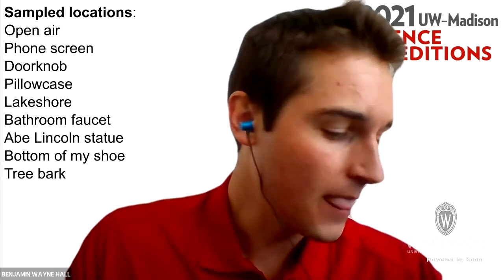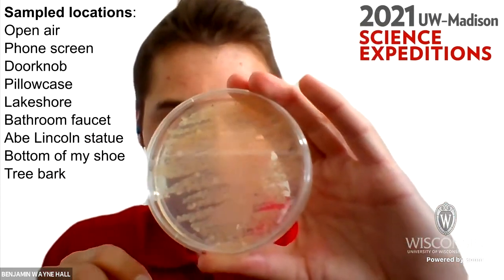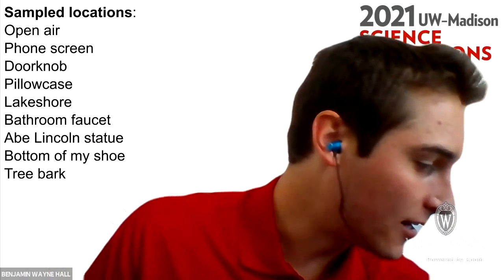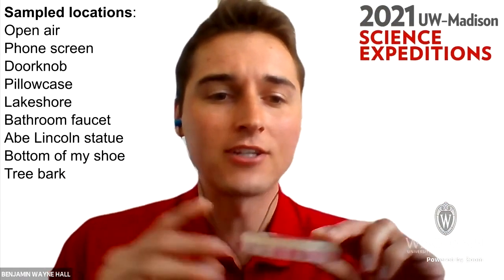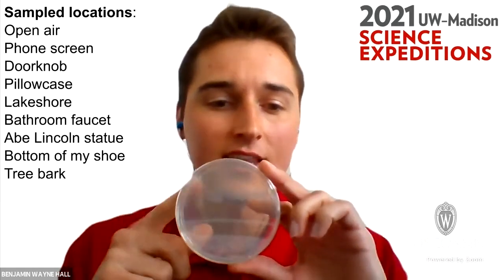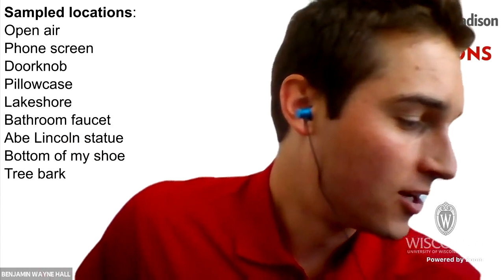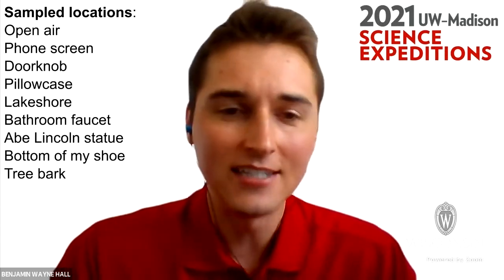So maybe lots of these bacteria from the lake just really like the food that I gave them. And the phone screen, maybe this just wasn't the right food. So if I went and repeated this experiment and tried with a different kind of food, we might actually see that this plate from the phone screen gets covered in bacteria. So yeah, that's a really important point, is that different bacteria like to live in different places and they like to eat different foods.